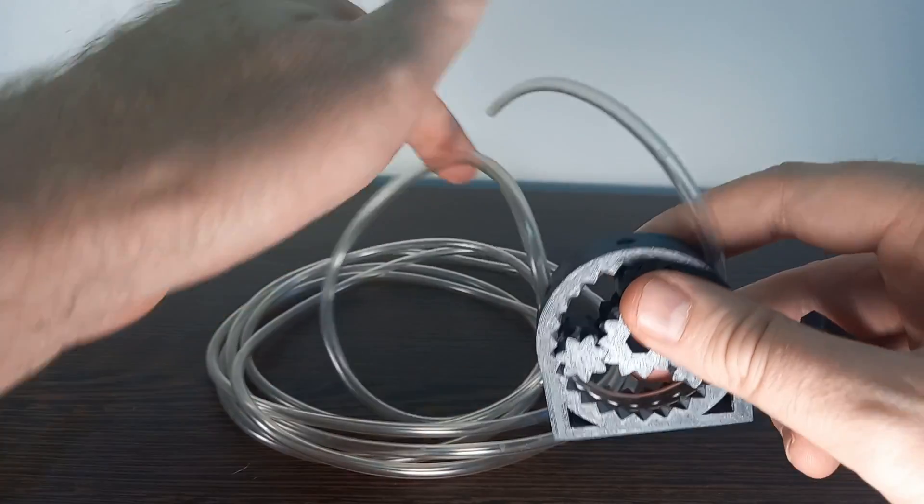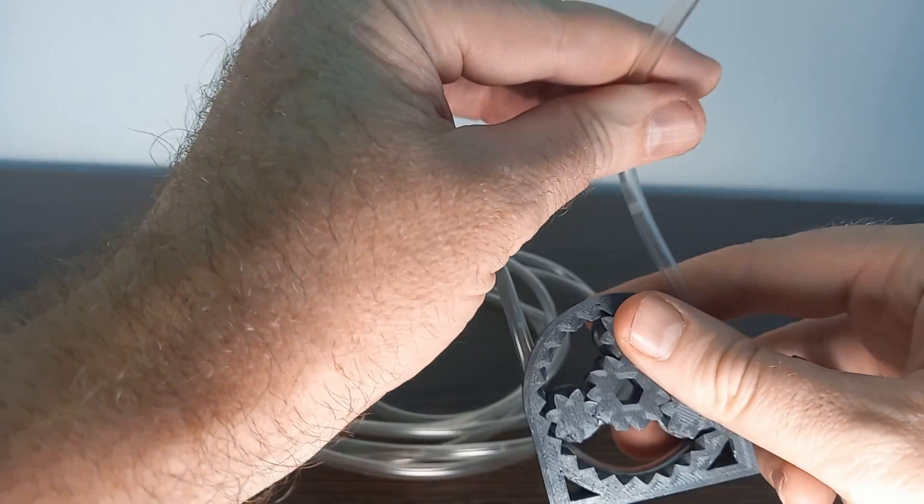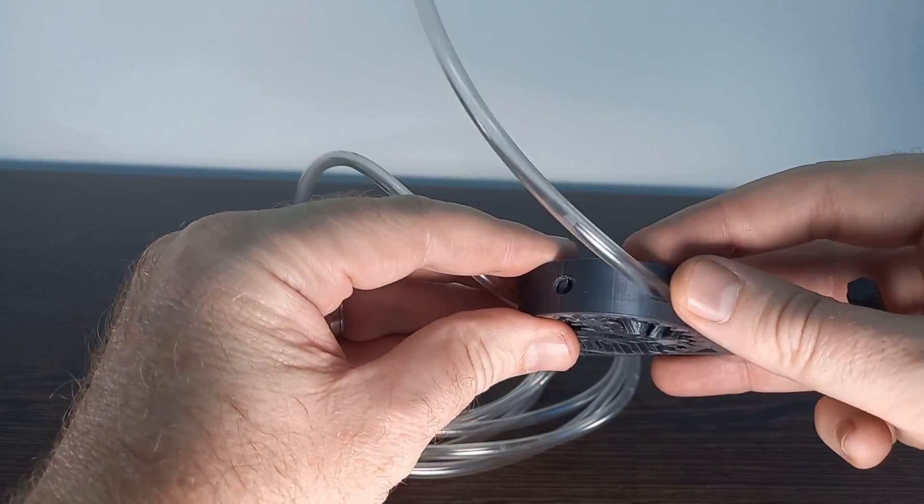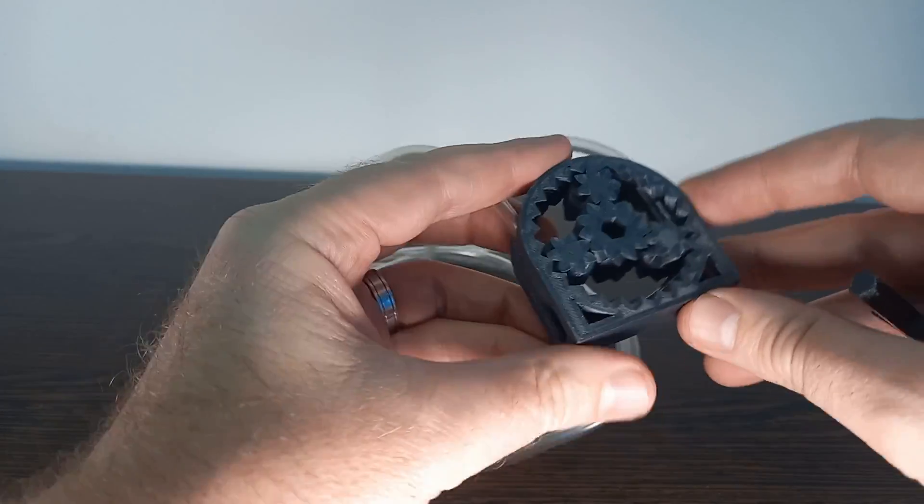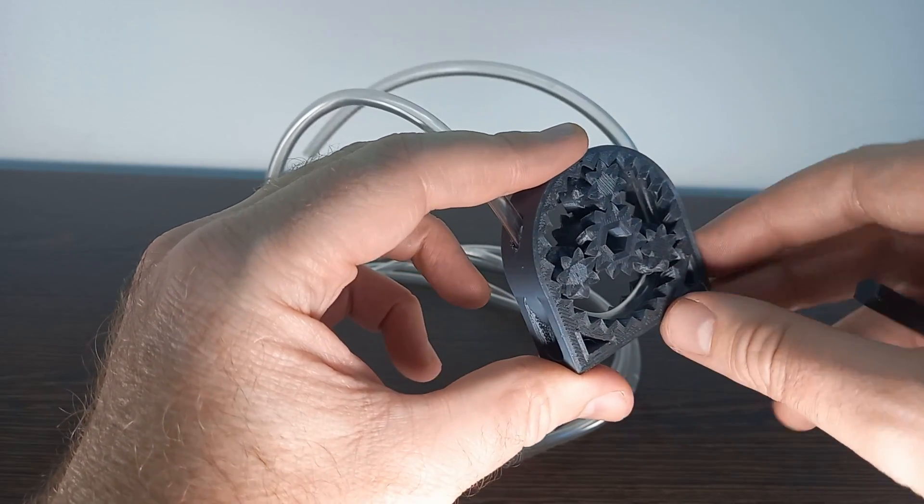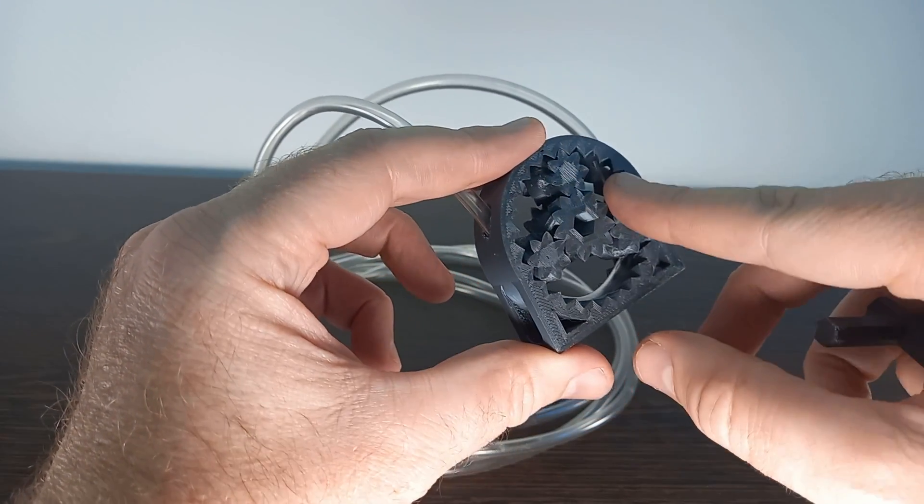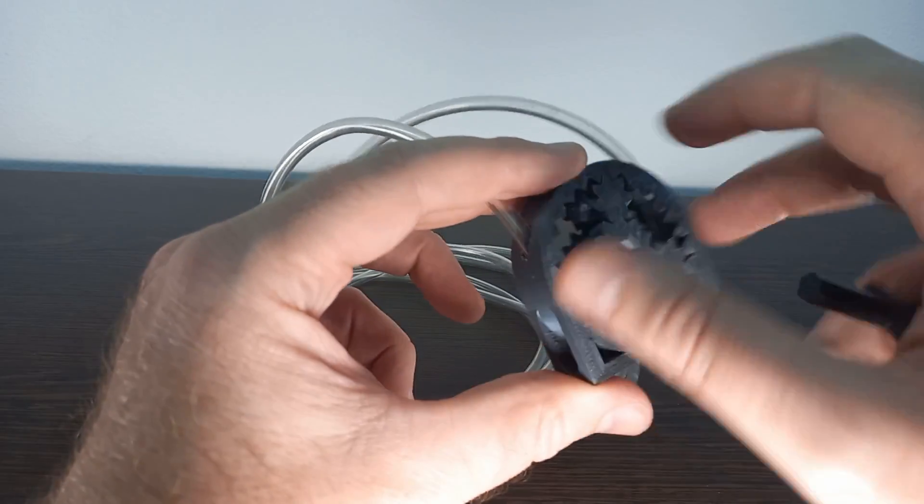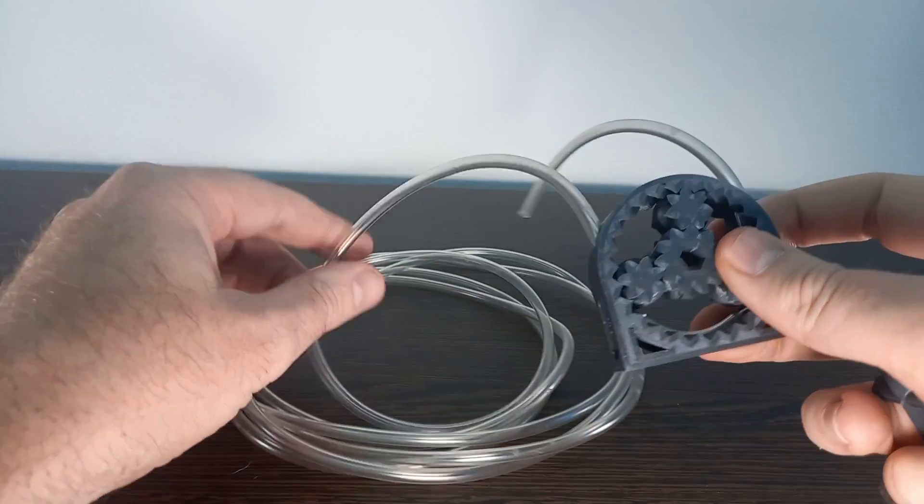We again have some form of tubing that runs into one side. It goes around on the inside and out on the other side.